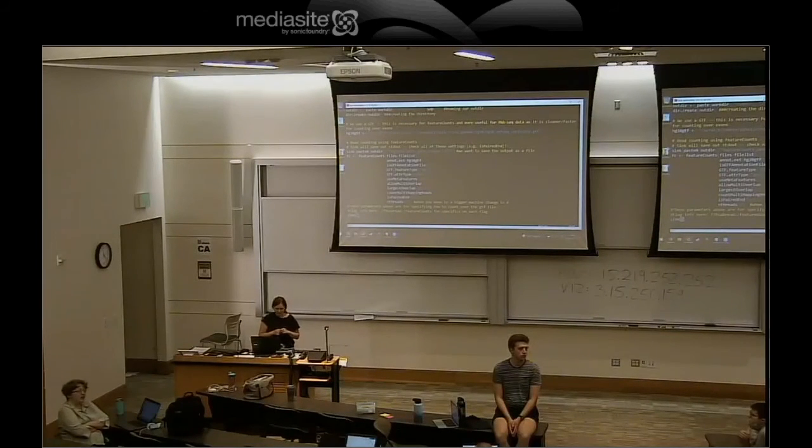You can do it live. You can literally go on the head node, just type R and work through it. It's not a good idea. It's better to set your script up so it's ready to go and submit it to the queue just like every other script. And you can imagine, right? You guys have so many BAMs. Imagine a situation where you have 12 samples and you're trying to type all those out on the R command line. You're probably going to make a mistake. So doing it in a script like this helps you prevent those mistakes.